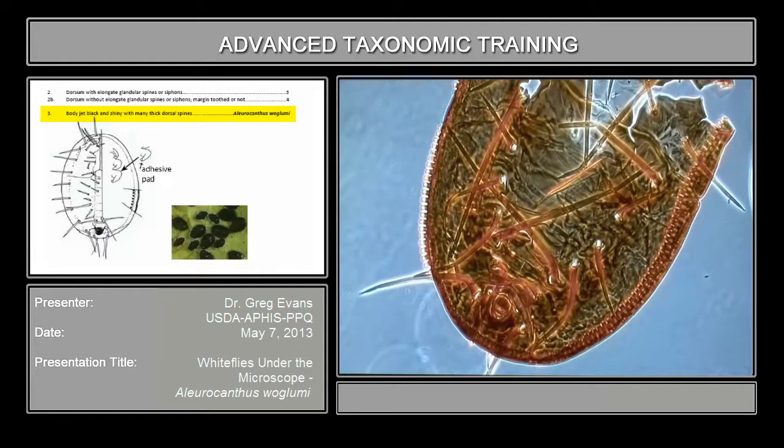When you get down to identifying this to species, you need to start counting how many of these spines there are and other characters. Some species have them very short, et cetera.